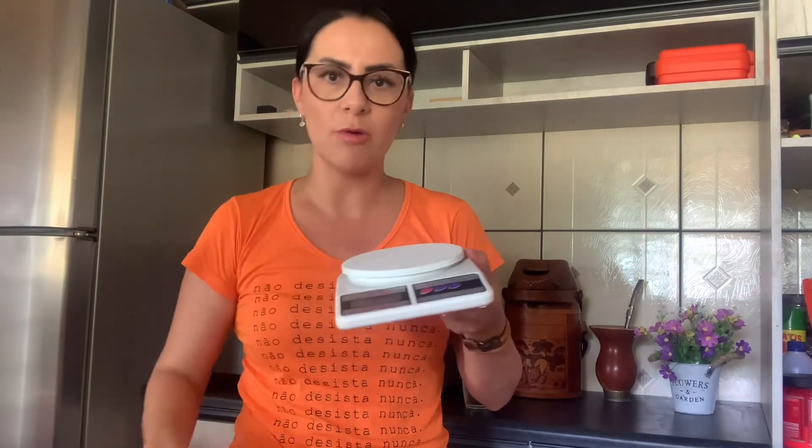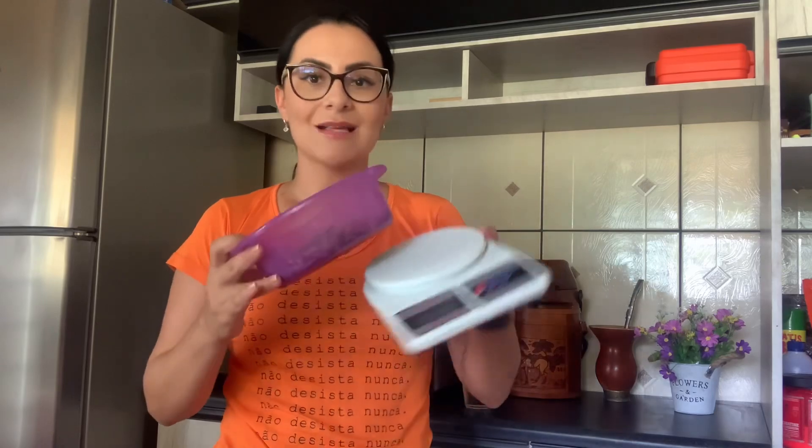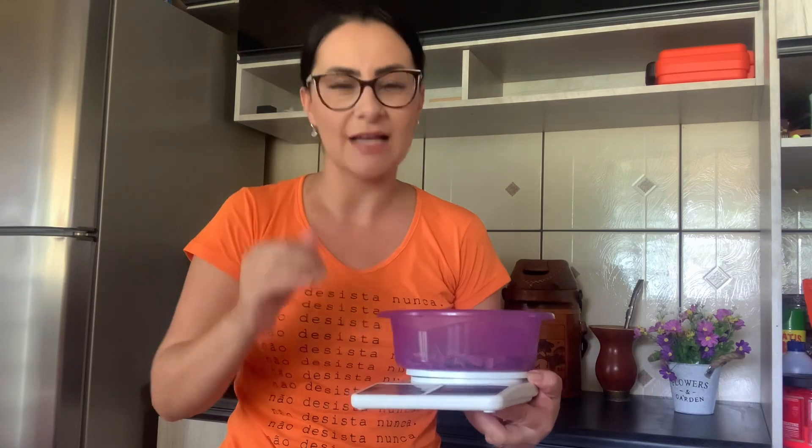Vamos lá pessoal. Primeiro passo: seleciona a amostra que vocês vão utilizar — aqui no caso capiaçu. Coloca a bandeja vazia na tara da balança e aperta para zerar a pesagem, assim a vasilha não vai pesar a mais. Vão esparramar essa amostra na bandeja e pesar. Ela tem que ter aproximadamente 100 gramas. Aqui já deu 100 gramas — não precisa ser exato, mas quanto mais próximo melhor.